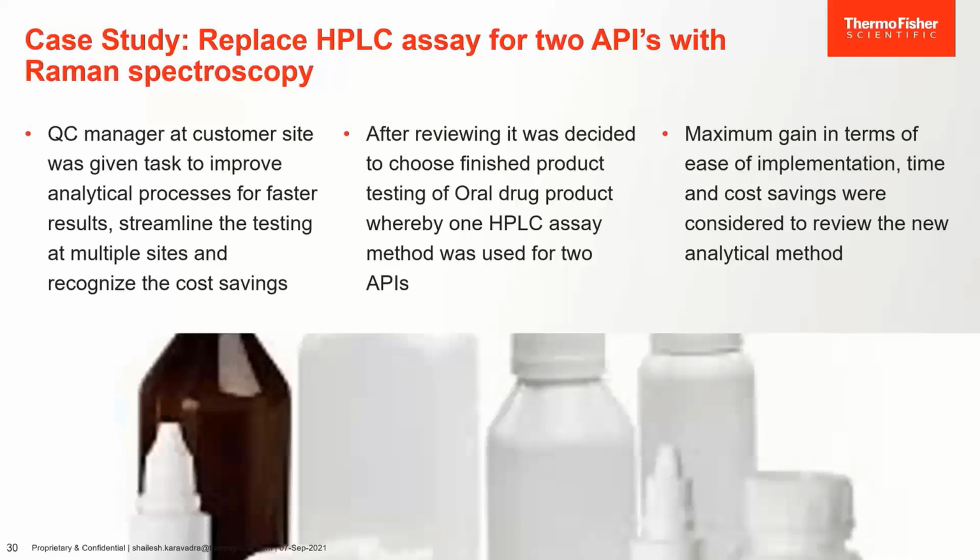Another case study is to look at the replacement of an HPLC assay for 2 APIs with Raman spectroscopy. We were given a task to look at an application study which involved measurement of 2 APIs for a single oral drug product.